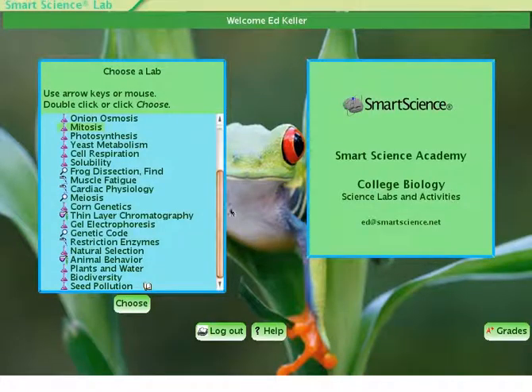Welcome to the tour of a Smart Science College Biology Lab. Today we're going to review the Smart Science lab called mitosis. I want you to notice a few things as we go through this Smart Science tour.